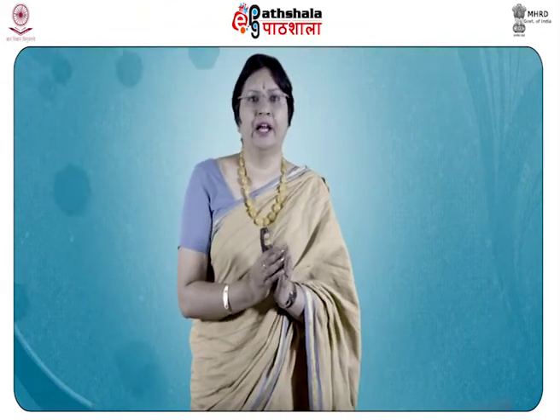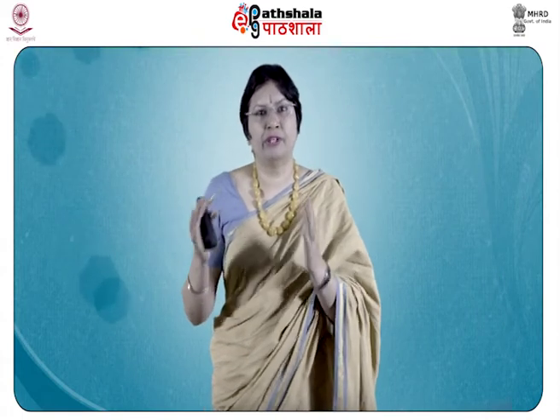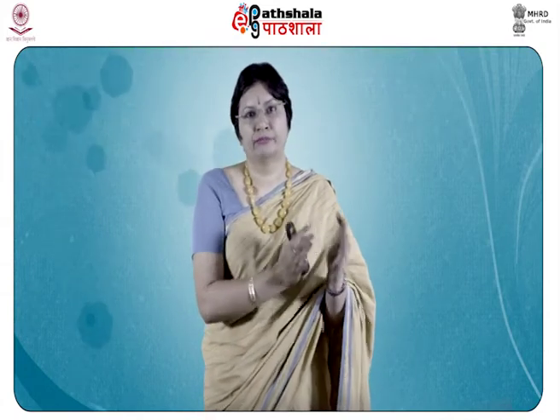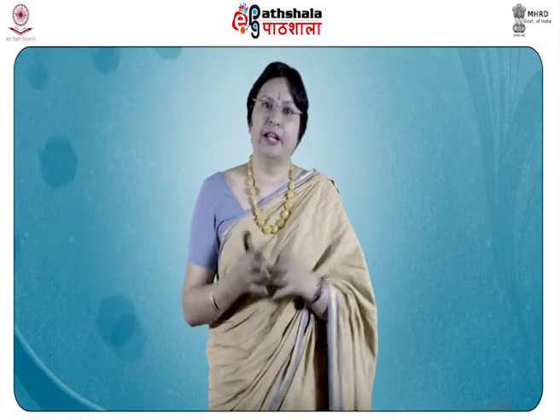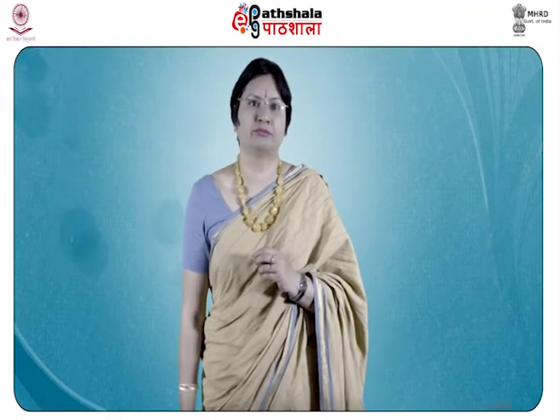You have the anions, you add the corresponding reagents, and there will be color formation or some precipitate, something very indicative, that you have to observe and compare with your sample from a reference one, and you will be able to detect this. So, let us try to understand these tests in more detail with the help of graphics and visuals.